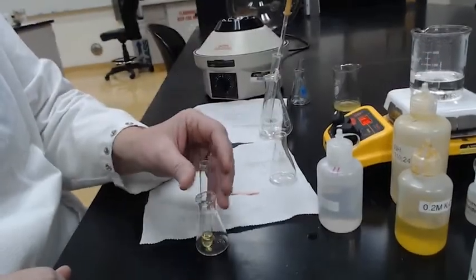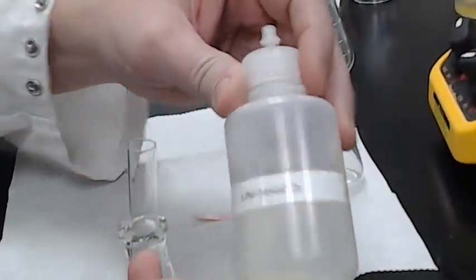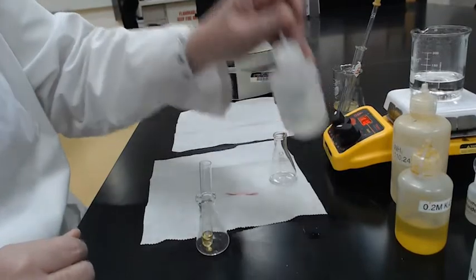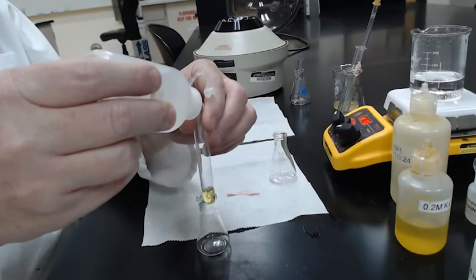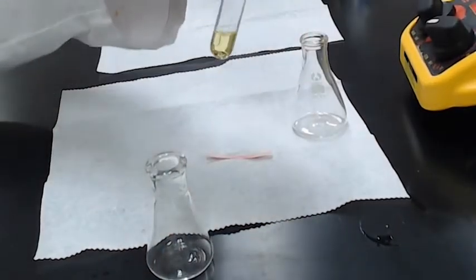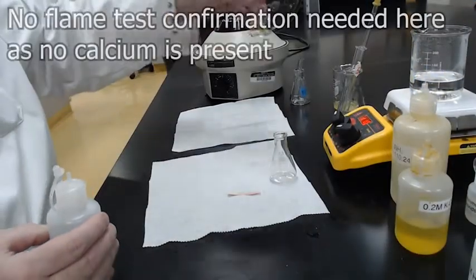Now to try to precipitate out the calcium, we're going to use this oxalate. Just a word of warning, oxalate will also precipitate both magnesium and barium. So hopefully we did a good job separating our unknown earlier, and we're looking for any precipitate to see if it's there. We added 2 drops. I don't see any cloudiness. Remember, a negative is a possible result. I'm going to try one more drop, but this exceeds what we're supposed to add. And I do not see any precipitate, so I'm concluding we are done with that part of the experiment.